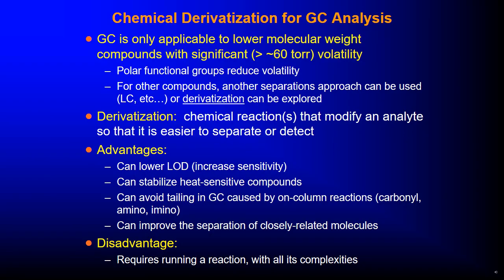Then there is what we call chemical derivatization for gas chromatography analysis. Gas chromatography is only applicable to lower molecular weight compounds with significant volatility, greater than approximately 60 torr vapor pressure.